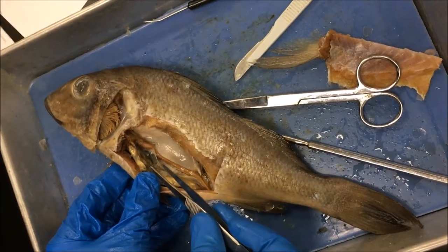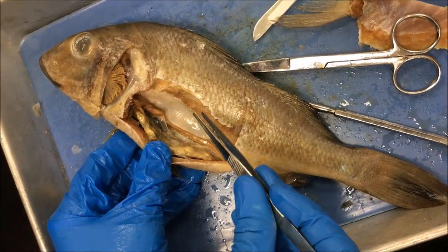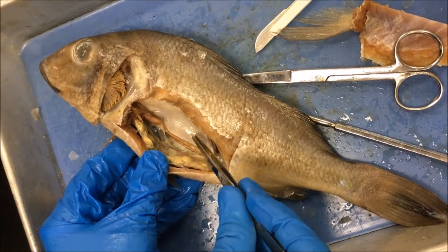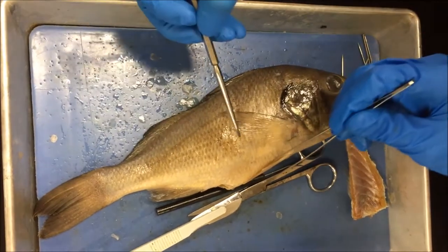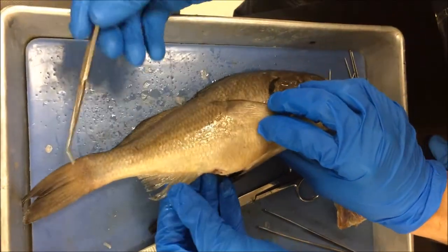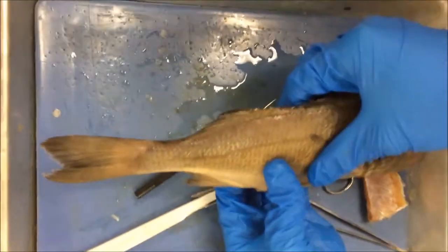The swim bladder is this white organ — a gaseous pocket that maintains neutral buoyancy using the gas gland and the oval body. It takes in or expels gas to counteract gravity and allow the fish to hover in the water. This is the pectoral fin, this is the pelvic fin, and this is the anal fin. They all help with providing stability in water and helping the fish maintain orientation. This is the caudal fin, which moves side to side to thrust the fish forward in the water to escape from predators.